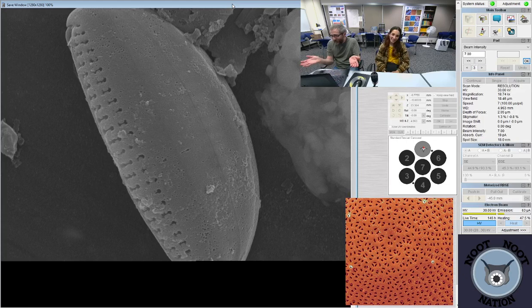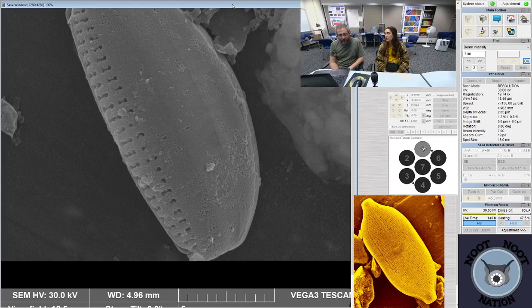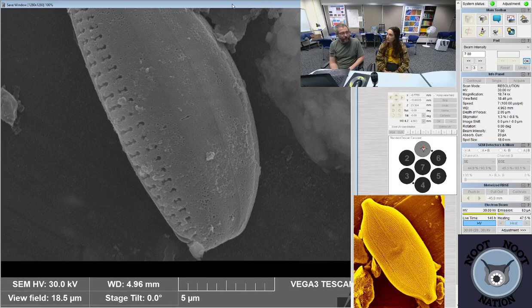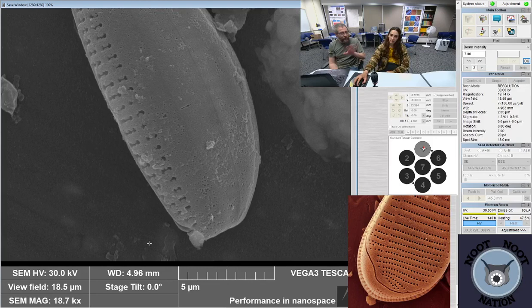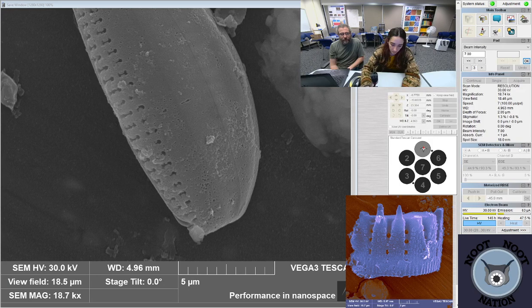Do I use gold because it is one of the best conductors? I do. What else could you use? Copper, if you didn't want to use gold. Silver, copper. You can even use carbon. Any metal will work, basically. We use gold because it's one of the better conductors, and we don't have to put very much on it as a result. And it allows the electrons to discharge very easily.